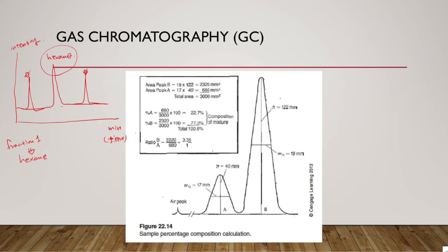Now the problem is, although we're expecting to see only one signal for our hexane, the hexane stock solvent we're using is actually called hexanes. It's plural, which means in this stock bottle we have many hexanes. So I hope you remember the constitutional isomers.